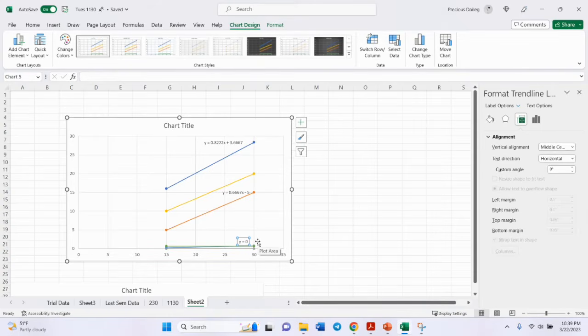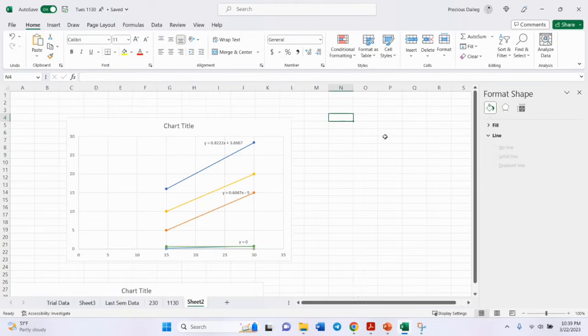And so if you're looking at your lab manual, that's going to be, let's see, number 9, the last step of what is in your lab manual, which says that you're graphing the velocity of gas production versus enzyme concentration or substrate concentration. So you have to do it for both, right? So what I'm going to do is I'm going to make a new table. I'll do enzyme concentration first. So enzyme concentration, and then this one would be your velocity, right?